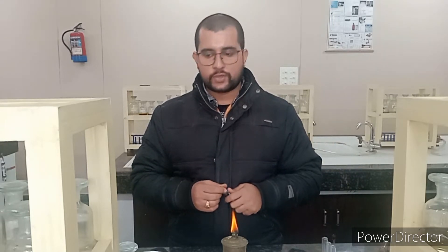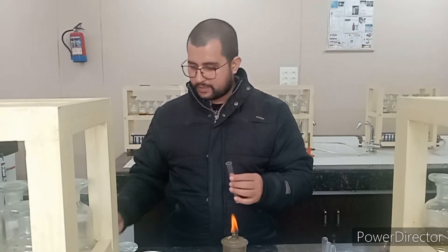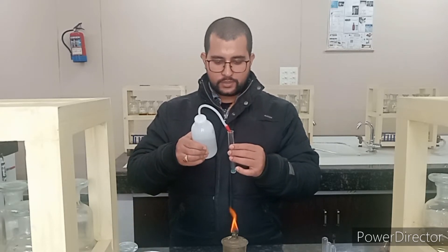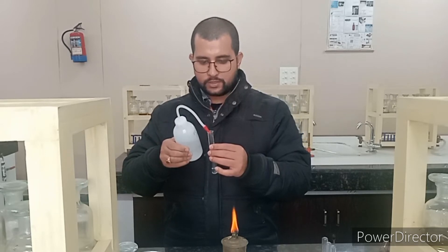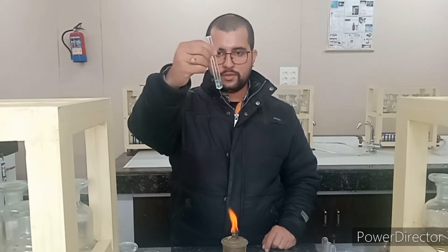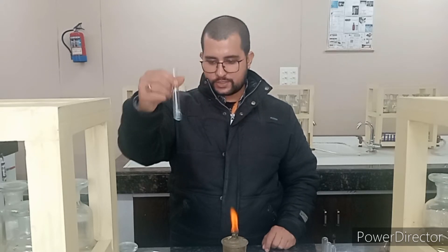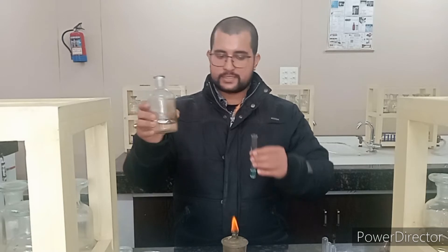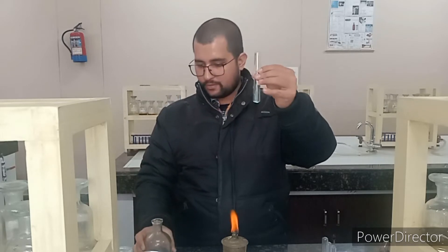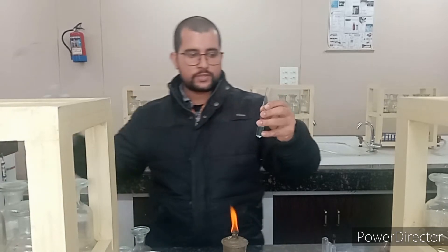Can you tell me the group reagent for the second group? The group reagent for the second group is H₂S gas in the presence of dilute HCl. I am making a clear transparent solution of this salt with distilled water and shaking it. It will give a clear transparent solution, and then I will add dilute HCl. Now we will pass H₂S gas and observe what is going to happen.